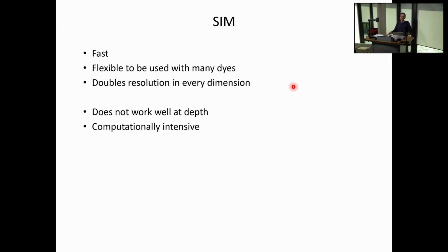And it is computationally very intensive. So a technique like this can easily generate tens of gigabytes of data per second. So it fills up a hard disk easily in a day of imaging, and then you have to deal with it and compute on this. And the computation is laborious. But of course it can be done on computers, and there are new ways of dealing with things with new methods such as machine learning and so on, all things that we actively pursue in our research groups.